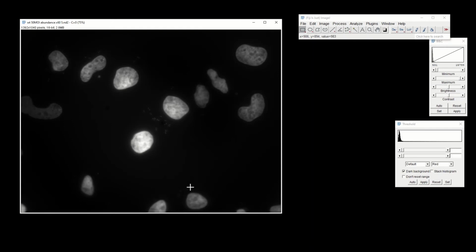Now, of course, you can count it manually. However, the point of this exercise is to learn how to count it using ImageJ. And you might be wondering, well, why would I do it? Well, in my past experiences, I've been looking at fields that have thousands of cells in them. And then you might have thousands of those images. And so if you want to quantify it, of course you can sit with a counter and quantify it, but it becomes a very daunting exercise. And so it's very convenient to use ImageJ to quantify those objects for us. So how do we do it?